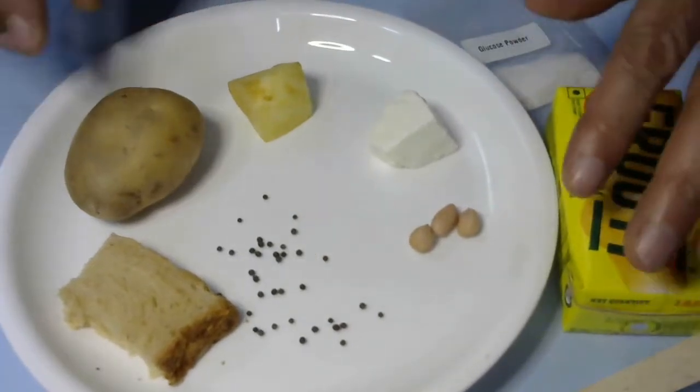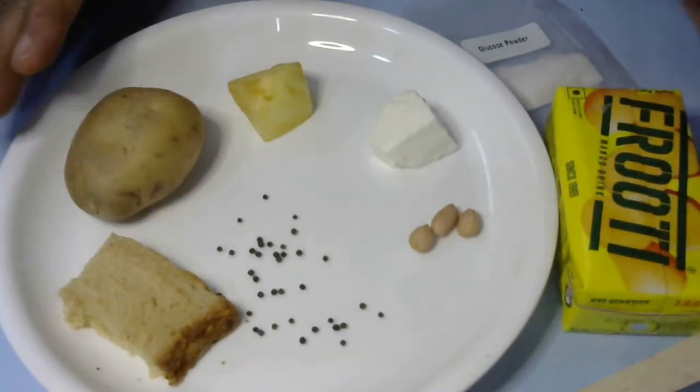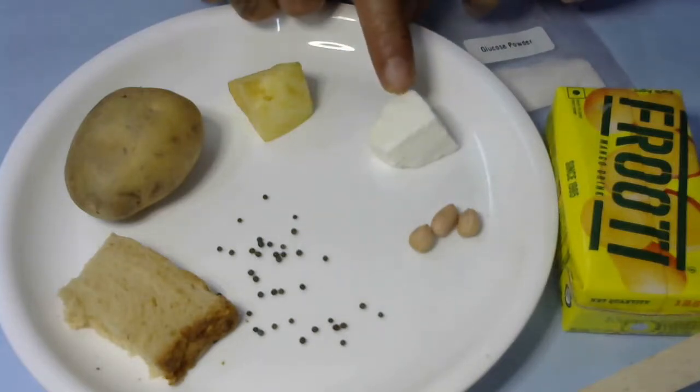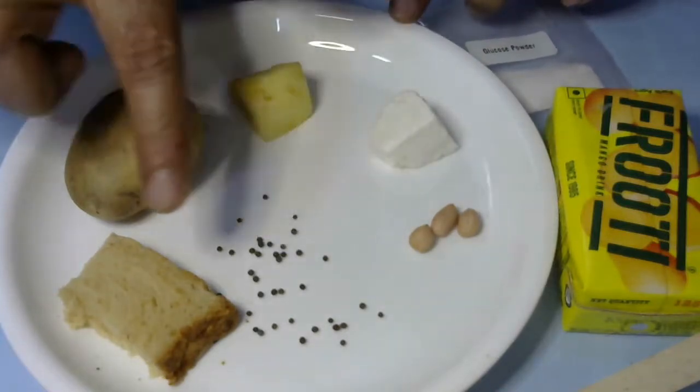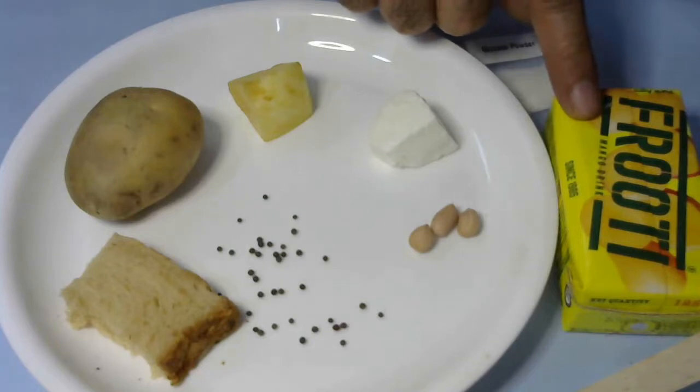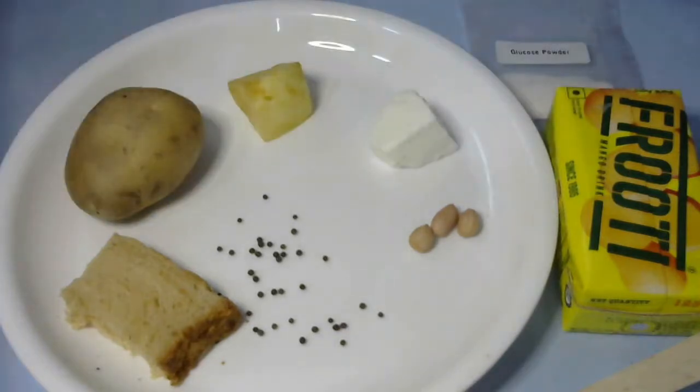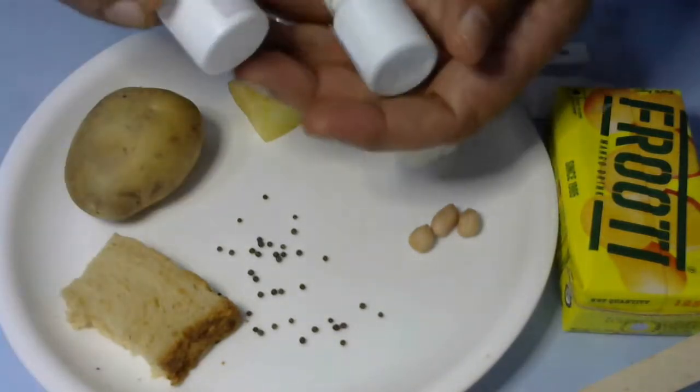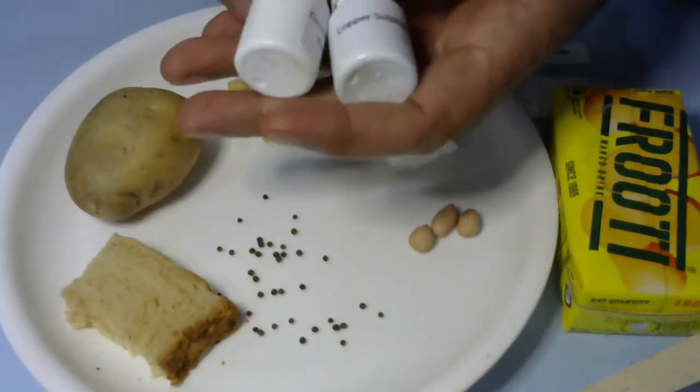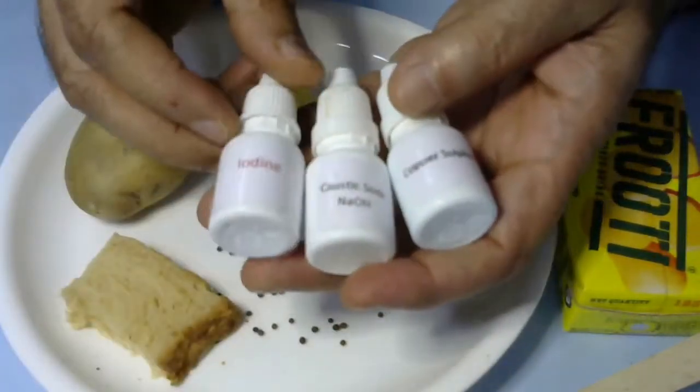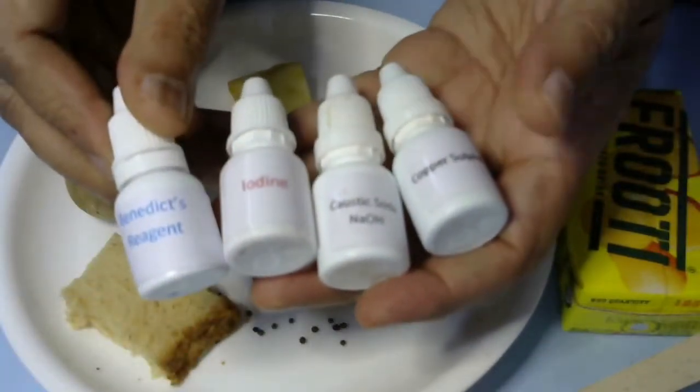For testing purposes, we have collected these food items: potato, fruit like apple, paneer, peanuts, mustard seeds, bread, and glucose powder to test glucose properly. We will need different chemicals from your kit: copper sulfate solution, caustic soda solution, iodine, and Benedict's reagent.